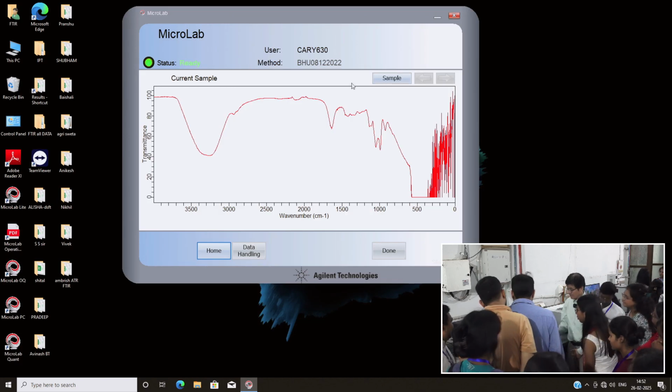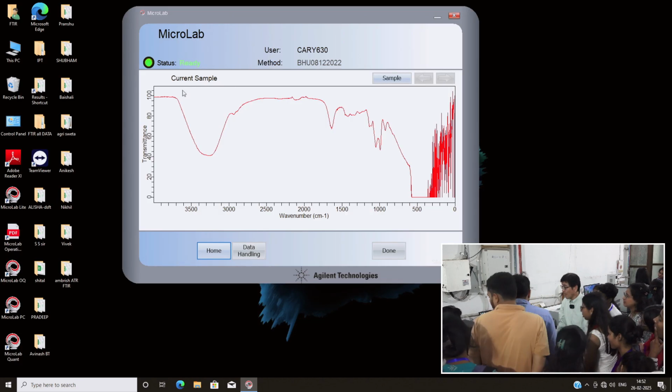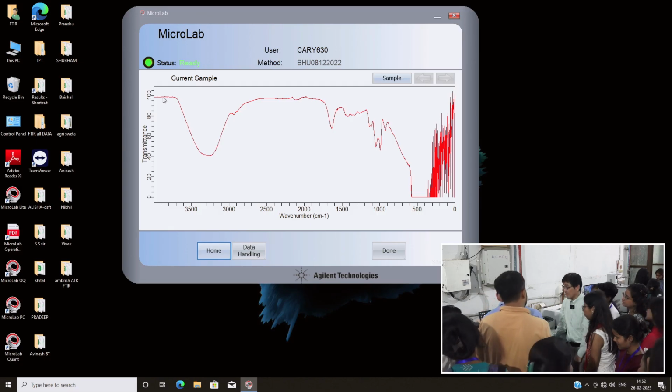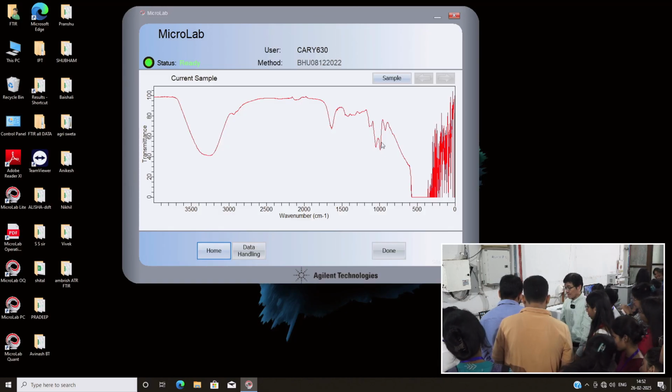Okay, you see the spectral pattern is quite different. The solvent is water, the salt is sucrose, and the concentration is 5 molar. Then, as we see in the solvent spectrum, OH stretching appears here and HOH bending appears here. In addition, there are several peaks.